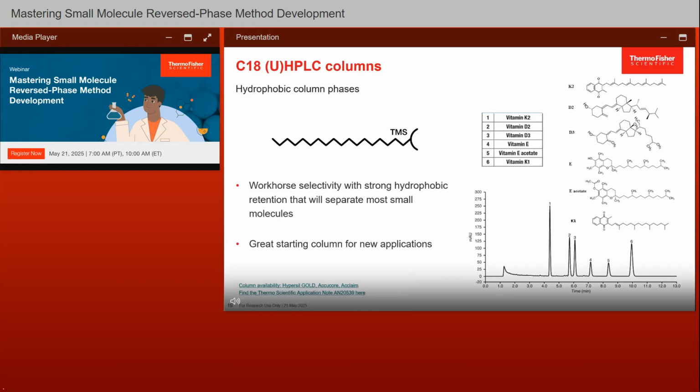It's important to understand that not all the C18s are the same. They would behave differently based on the bonding method and reagent used during manufacturing. We could have mono, di, trifunctional octadecyl silanes, which represent the primary bonding. The surface is then end capped to reduce any secondary interactions that would affect your chromatography. The percentage carbon determines the degree of surface hydrophobicity of a particular column. The higher the carbon, the more hydrophobic the surface would be.